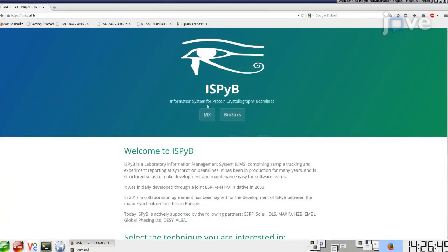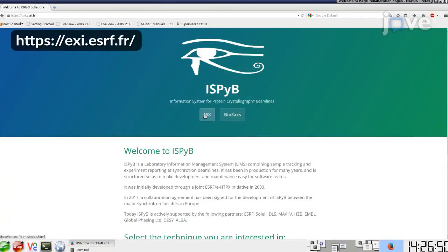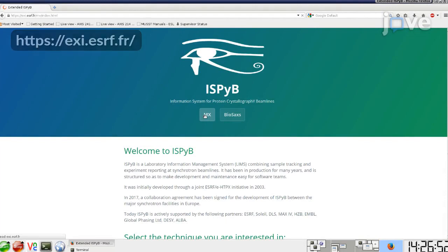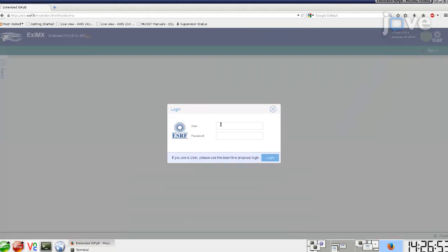Navigate to the Information System for Protein Crystallography Beamlines, or iSpyB, website. Choose MX Experiments. Log in with the experiment number and password.